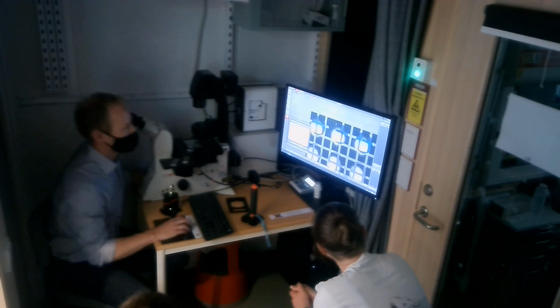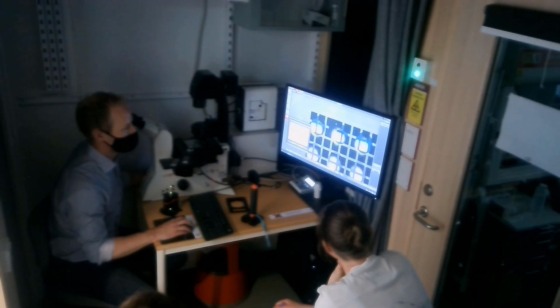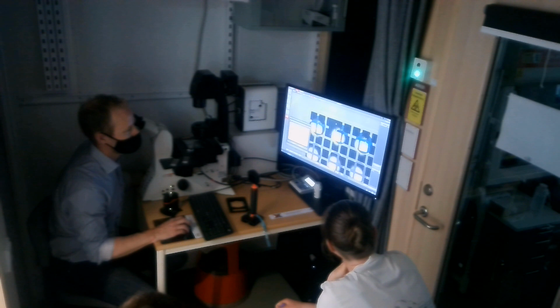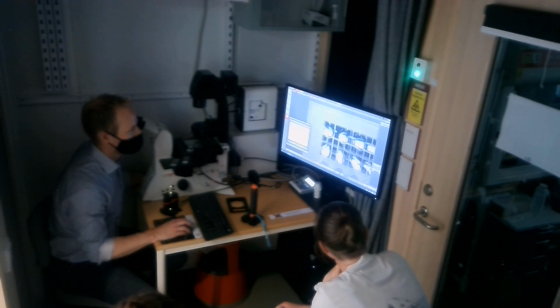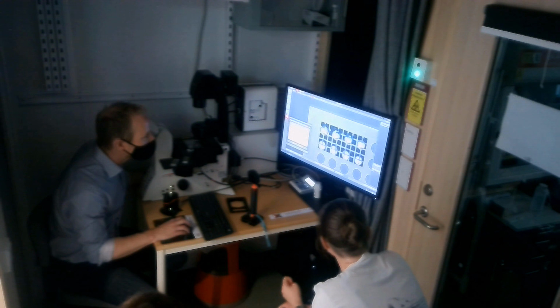Now I have to redo it because again I set it 9 with the 5x, so let's do this. There we go. Alright, and this now, they will be slightly on the edge here, so I think what I can do, and this is what I wanted to try to do, I think I can select them all, and I will try to drag them. Not possible to do like that.